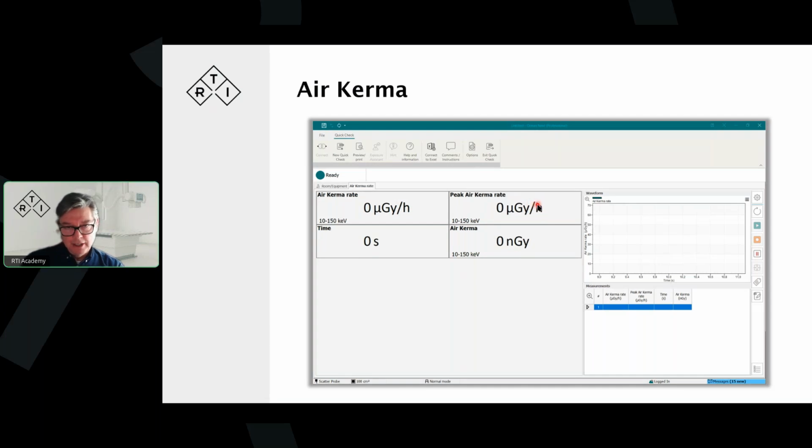The challenge here that we see is that there are burst events that we experience when we make a longer exposure time that can influence this. And if you have a fast instrument like the scatter probe, it might pick up a reading, it might detect even these small bursts that could be milli or microseconds long.